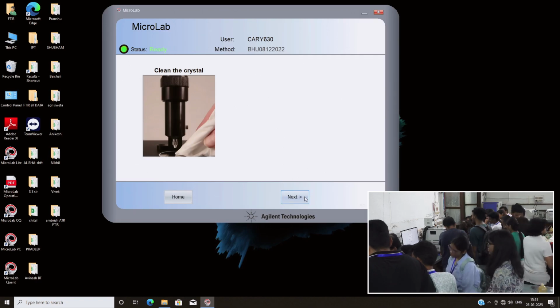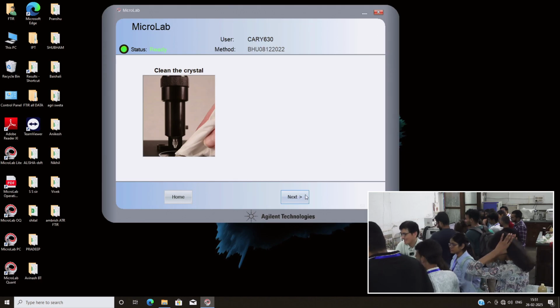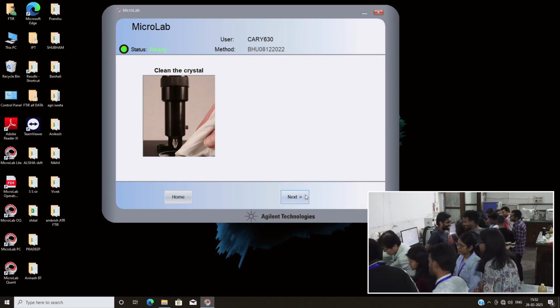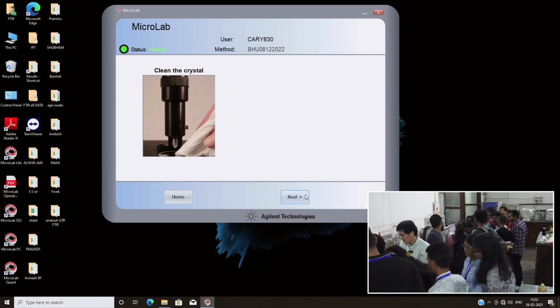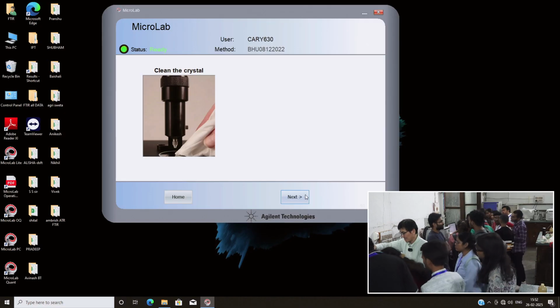Just a moment. You should save the data. Okay, next person. Please remove the sample. Do not scratch. And also this part is fit.